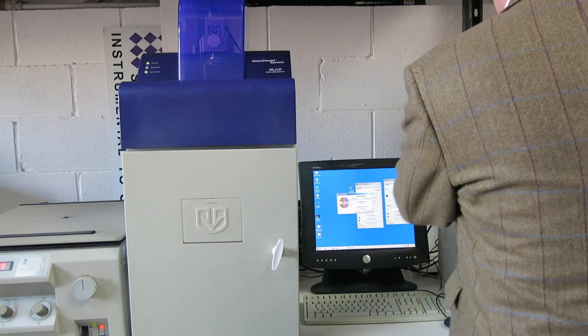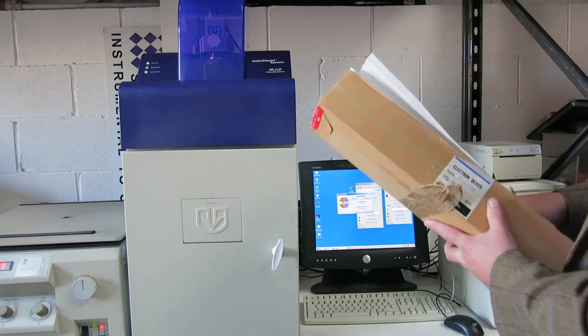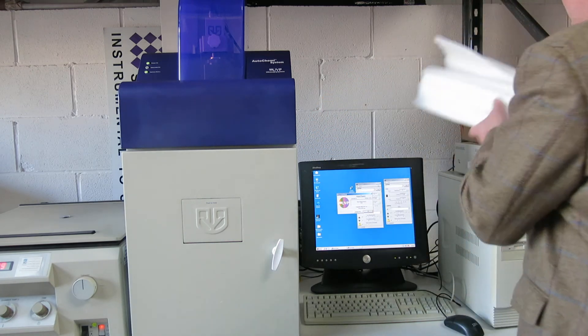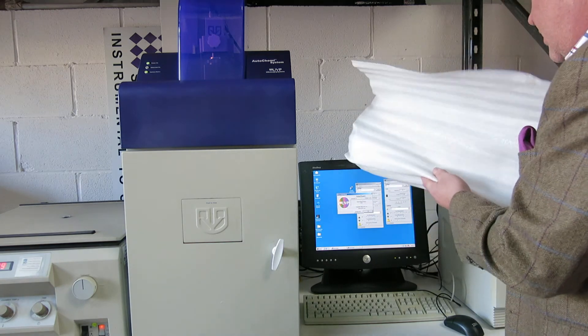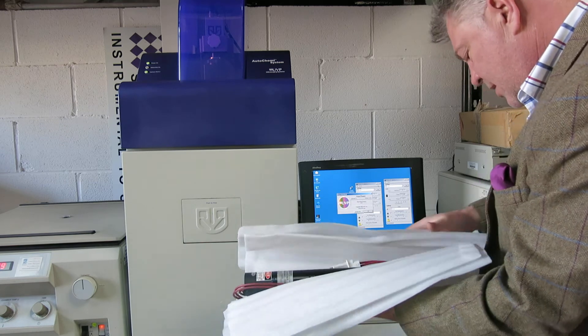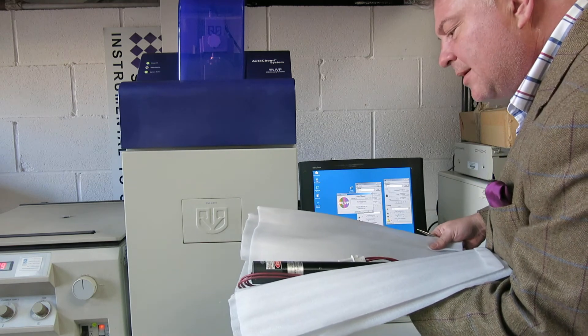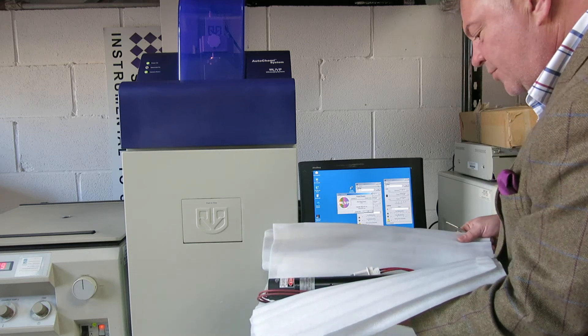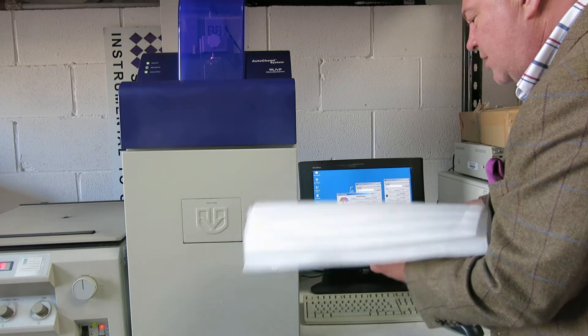We've also got a spare laser, which is here, which is extremely useful. That is the spare laser that goes with it — it looks like a Melles Griot laser but it's actually an NEC Corporation laser. There's a spare laser that goes with it, which is pretty handy.